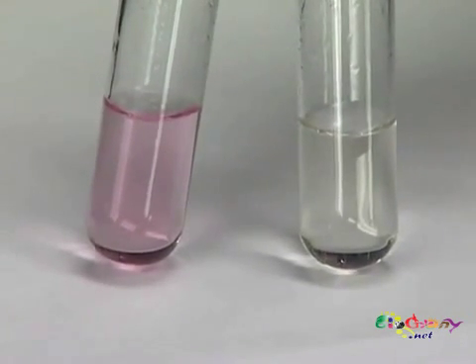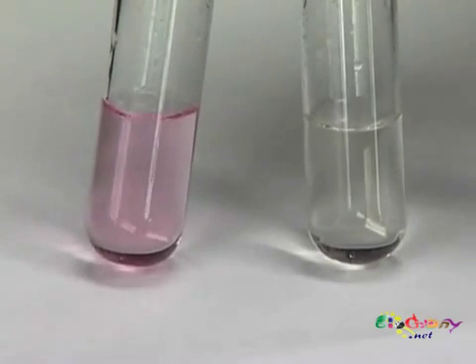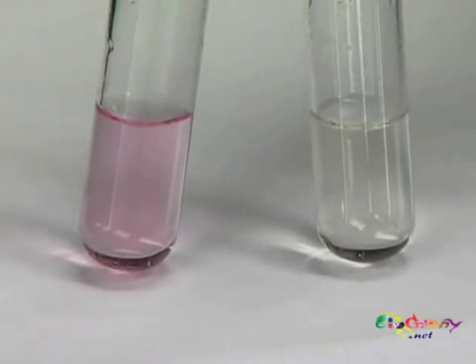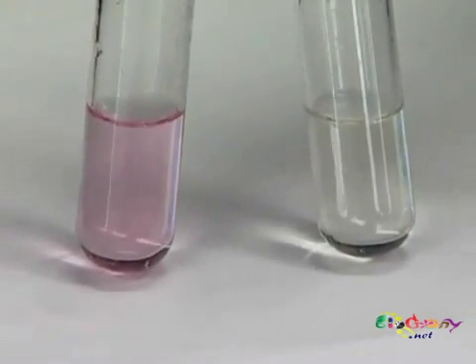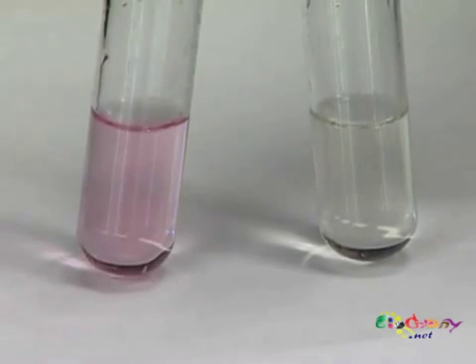Now that you've reduced your media, it should go from blue to pink to clear. Now, after you autoclave them, all of your tubes should be clear. If they are still pink, this means that either you have oxygen contamination or your media is too acidic. Now that your media is made, it's ready to autoclave.